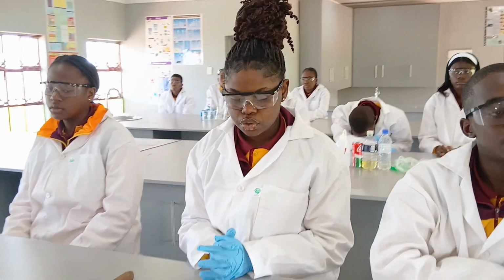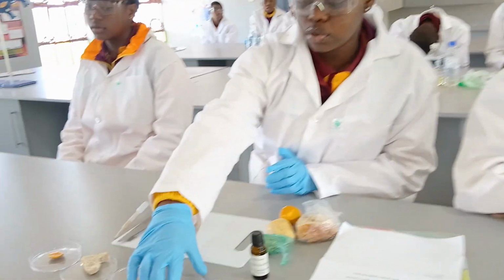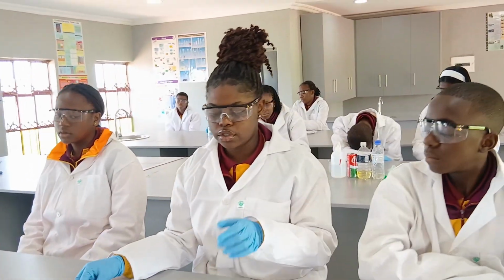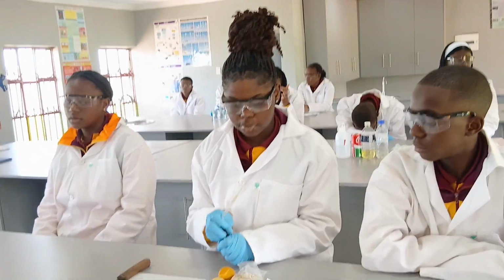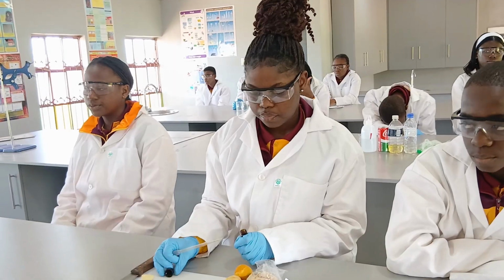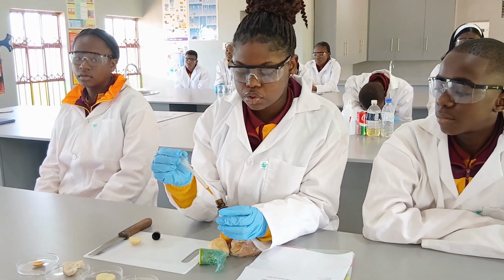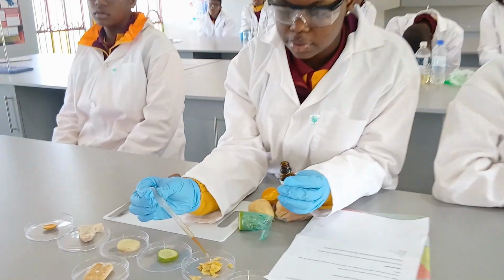Firstly, we are going to use the iodine solution and the dropper, using the dropper to drop the iodine solution on top of the food samples. We are then going to add about 2 drops of iodine solution onto the different food samples.